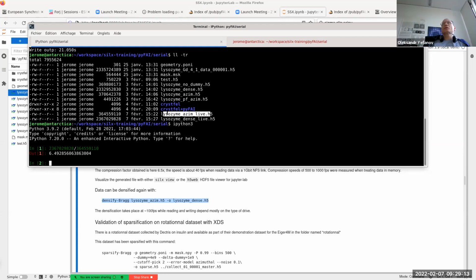Why don't you just make integers from floating point? Because the leftovers of photons don't really matter. This won't work with Eiger data. We're not working with kilo electron volts. We are working with photons already. You mean Jungfrau, no? Yeah, Jérôme? No, the data we are using here are Eiger data.